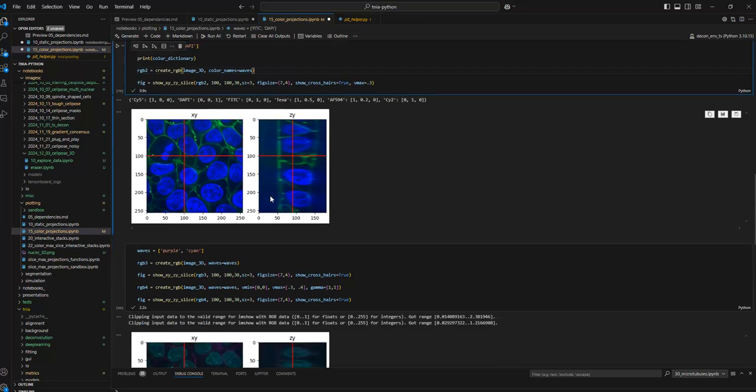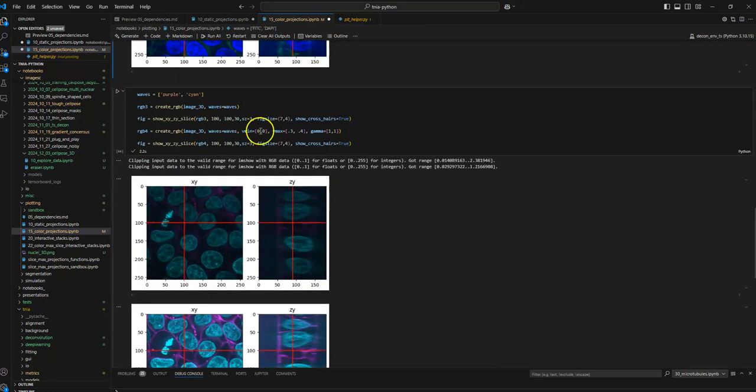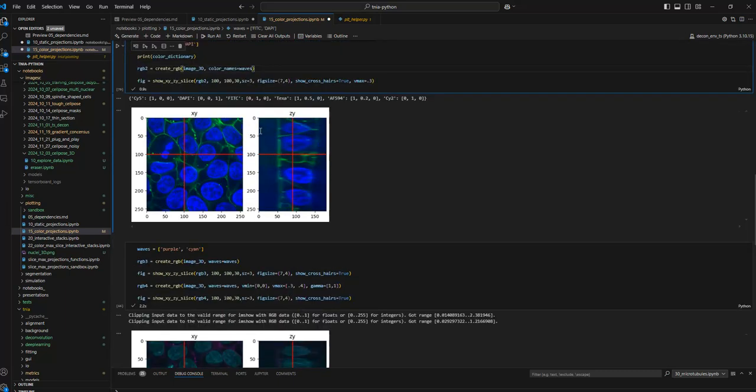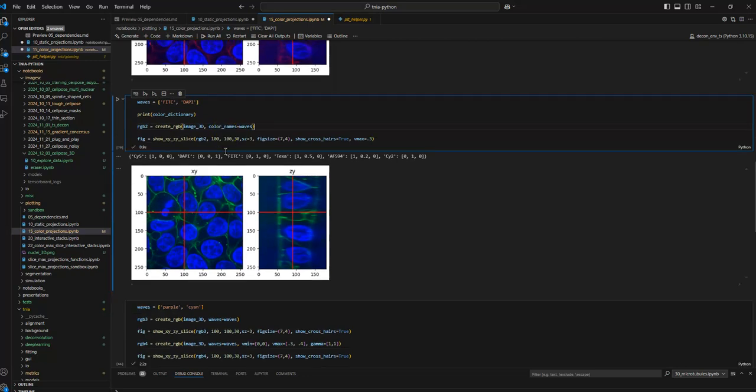So that's basically giving it a list of dye names. And I'll just emphasize here, I'm not a microscopist. I do some contract work in microscopy, so this whole idea of these dye names and how they're colored is definitely an area for more development and expert knowledge.